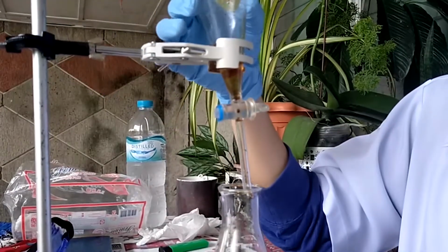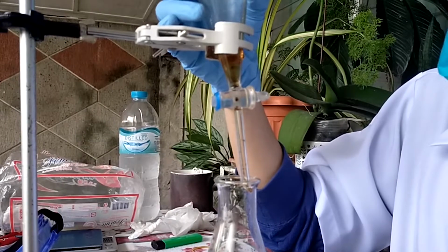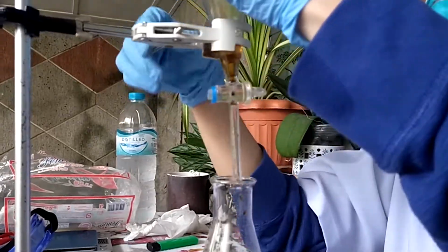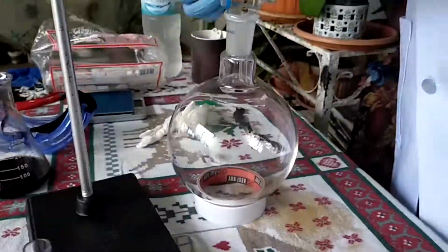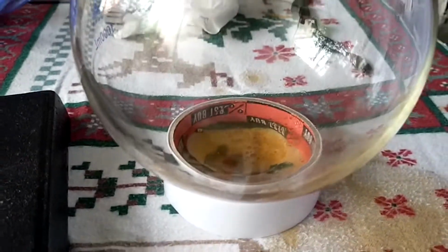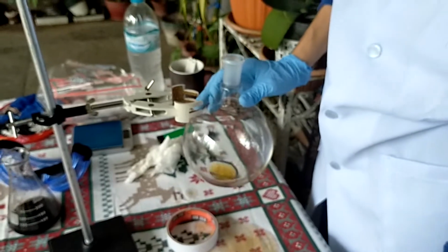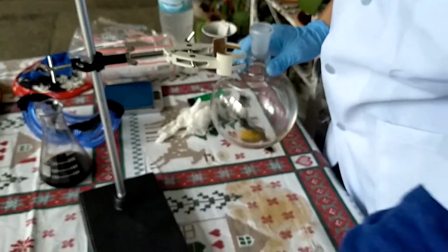Now this is now our extract, our organic layer. I will put this in a separate flask. I'll put this in the flask where I will be placing it in the distillation tank. Okay, so this was the result of my first extraction. So next we're going to do this 9 more times.